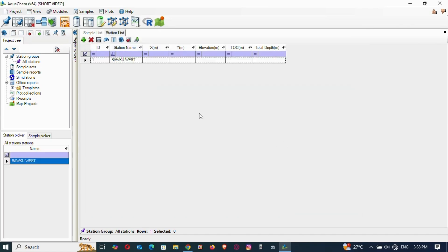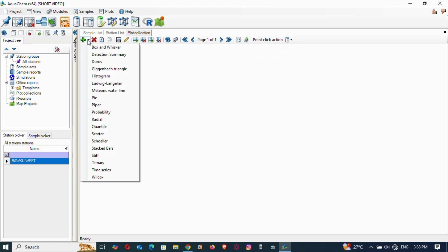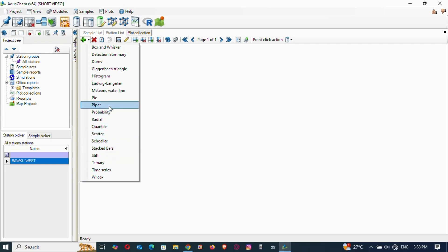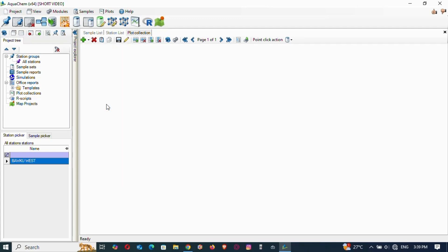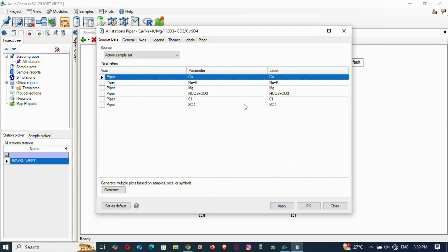Once done, go to Plots > New Plots and click the plus sign. You will see all the diagrams you can plot. You can see the Piper and the Wilcox/USSL options. Since we said we're beginning with the Piper, select it and it will appear automatically.